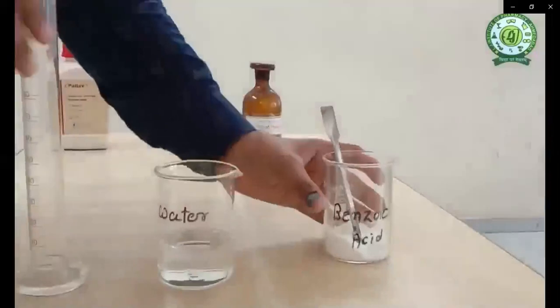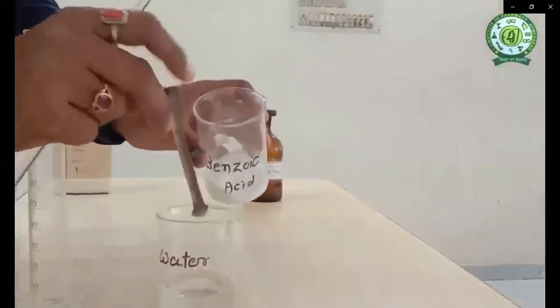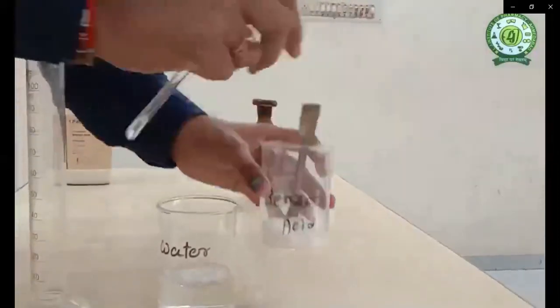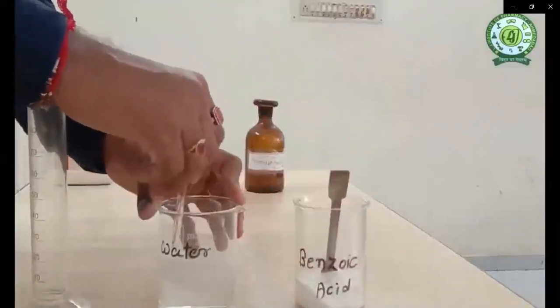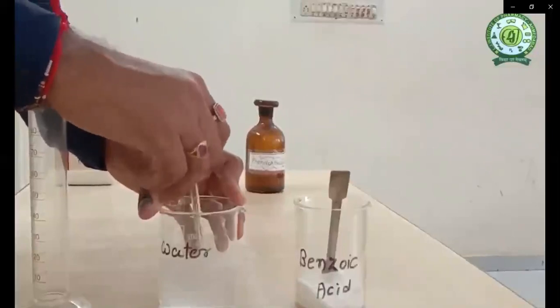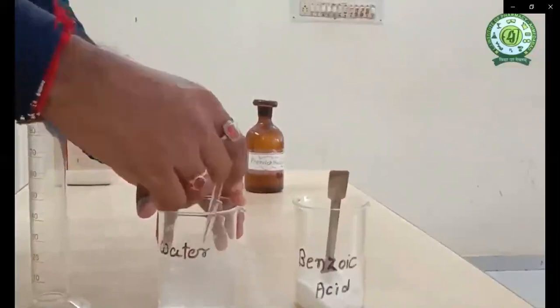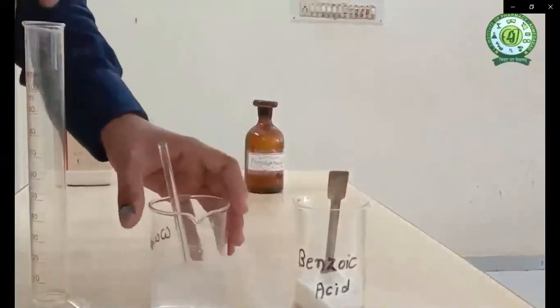As we have to prepare the saturated solution of benzoic acid, now we are going to add a small quantity of benzoic acid so that it will form a saturated solution. The addition is with continuous stirring, as the stirring may also affect the solubility. So we are continuously stirring the solution. After the solution is prepared, we have to filter it so that we can remove the undissolved part.